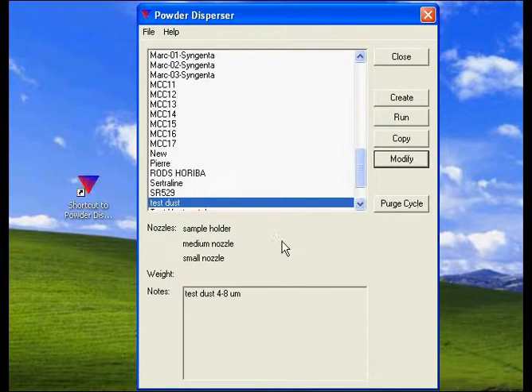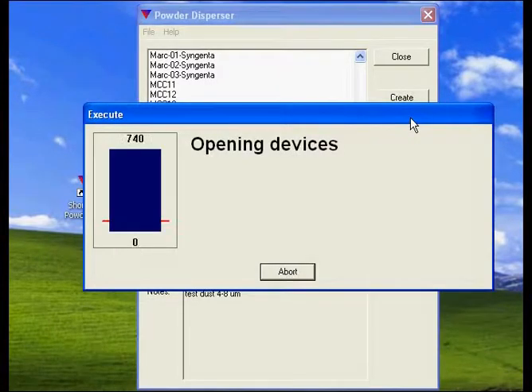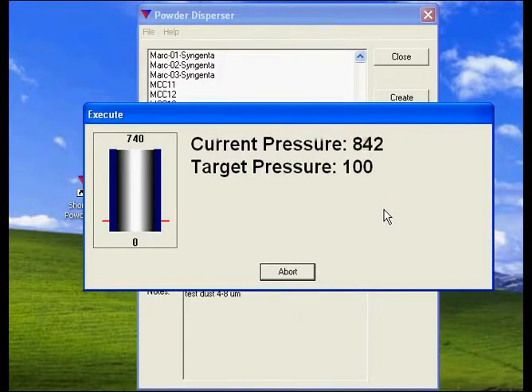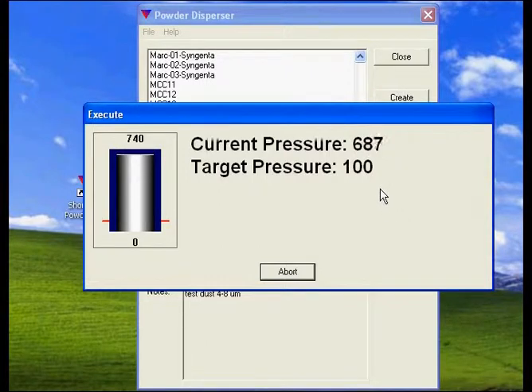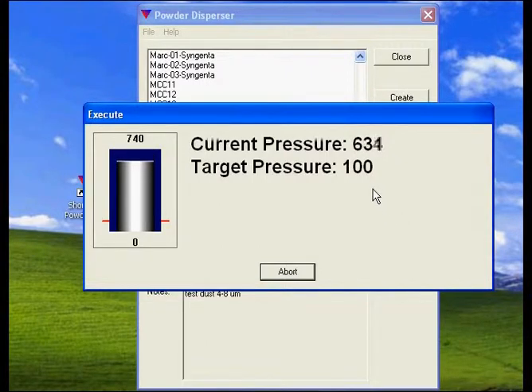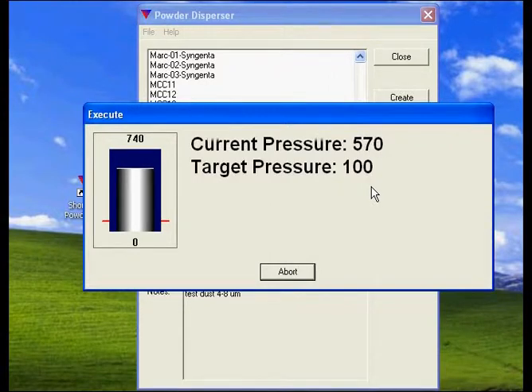When your test is ready, all you have to do is click run. The dispersion will start creating the vacuum. When it reaches 100, the blast of air will release the particles into the chamber.